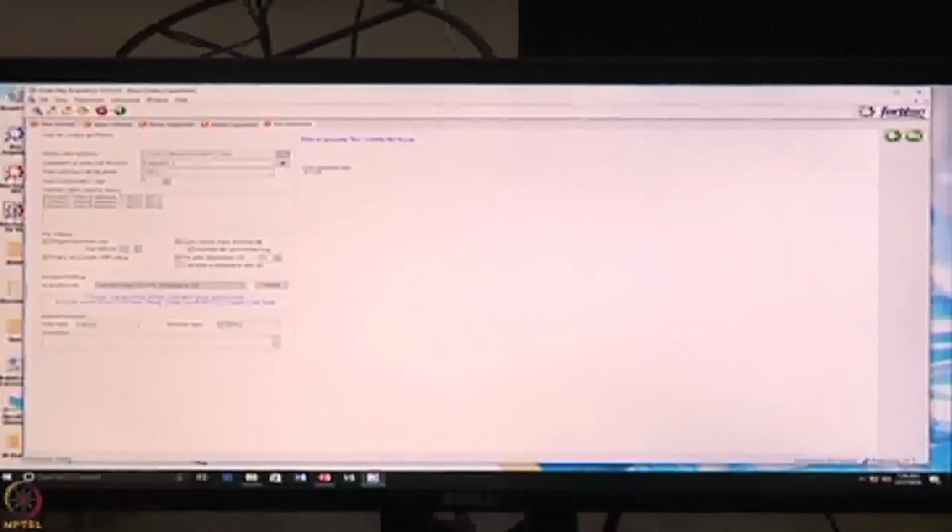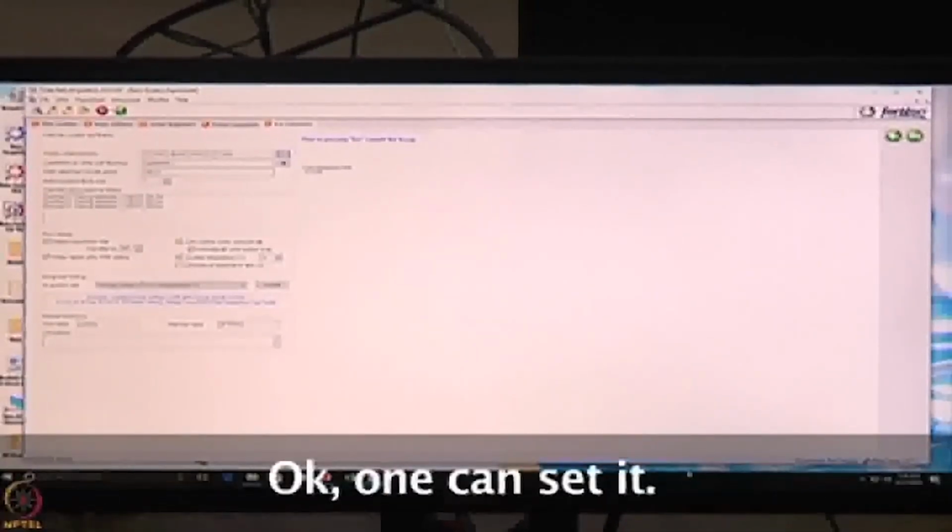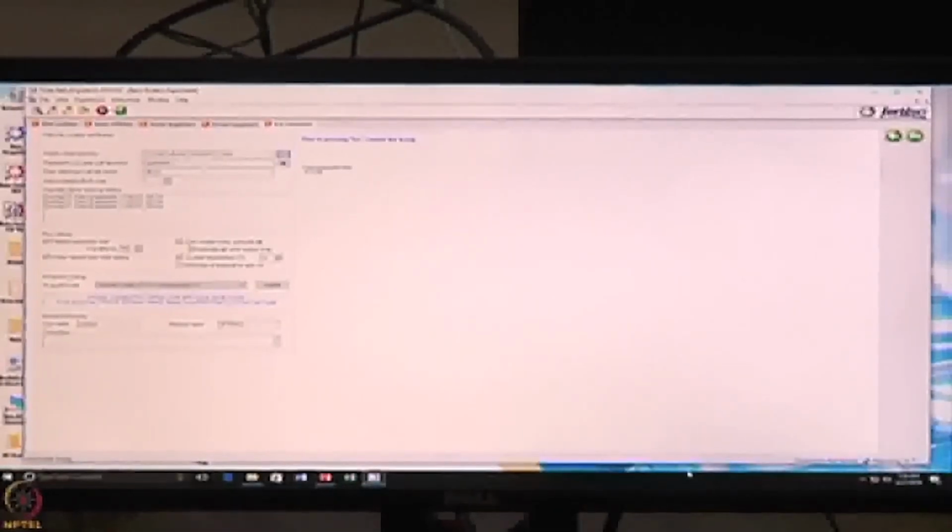For temperature, we are at 23 degrees, working at room temperature now. This instrument can work from 15 degrees to 40 degrees. You can set it and allow for stabilization, as it has a Peltier. So the next, what is your experiment name? I will just mention it as kinetics.